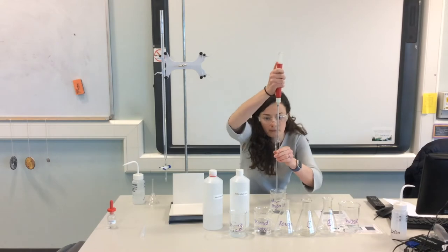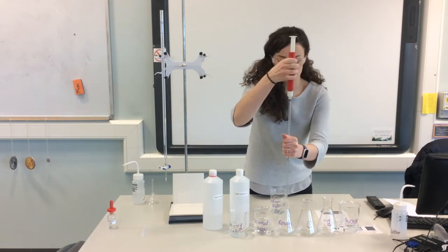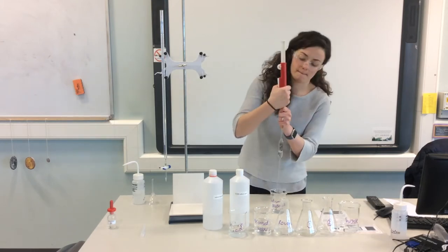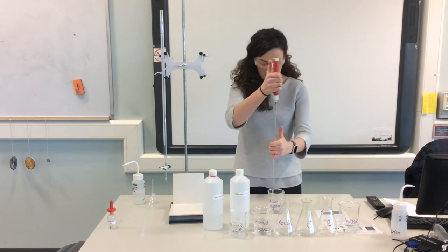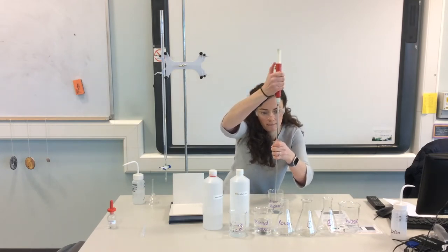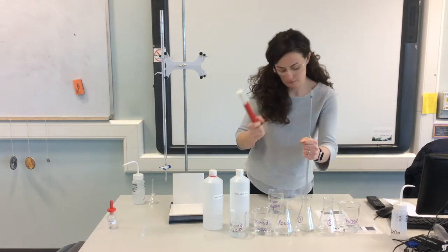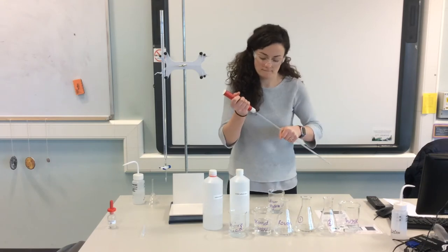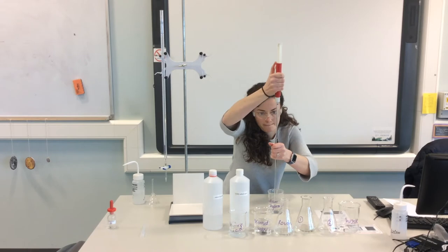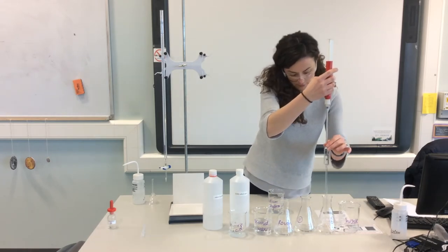Then you want to use your pipette to measure out exactly 25 centimeters cubed, and you've got to be exact about this, otherwise your titrations will be different and you'll have different amounts in there, which will then require a different number of moles of your sulfuric acid from your burette. So you use the pipette filler to draw the solution up until it's on the exact mark. Again, the bottom of the meniscus needs to be on that mark with no air bubbles, and release it into your conical flask.